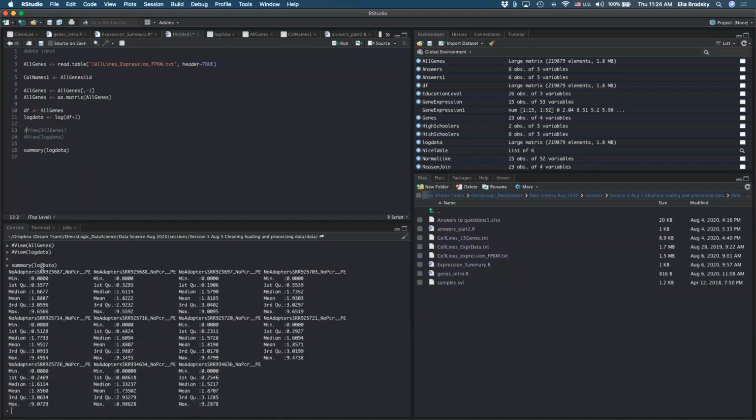Okay, so here we have a summary for each one of our samples, right? You have the minimum, first quartile, median, mean, third quartile, maximum, right? So all of this information, like for example, I can start seeing that all of my maximums are around 9, except for one of them.